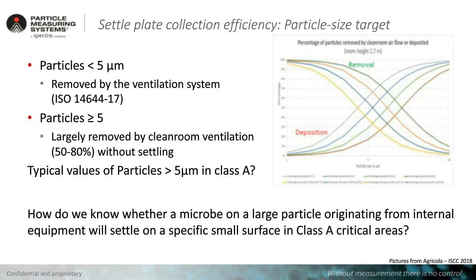And remember, the median of human particles and the median of microbial carrying particles is 10 microns, and the average shape of a skin flake is typically thin, 1 to 3 micrometer thin and 10 to 25 micrometer in diameter. That means these particles are the ones of interest that could be considered as risk factors in pharma.